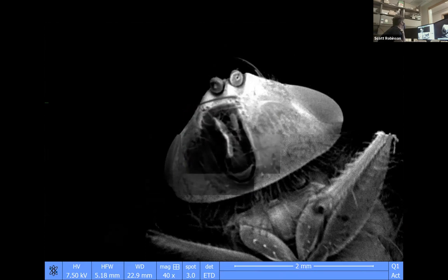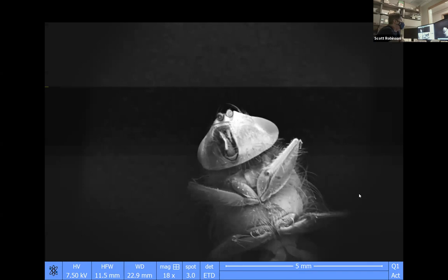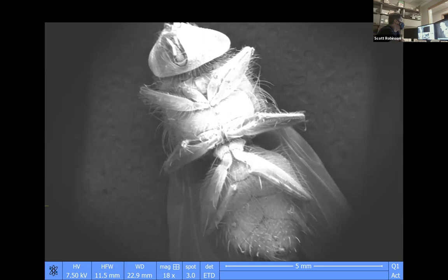I have a degree in English and biology, and it's helped me because for many years I used to rewrite publications and grant proposals for people, and then it just happened that I fell into doing electron microscopy. The kind of electron microscopy that I started out with is transmission electron microscopy, which is different from scanning electron microscopy. What we're doing right now is scanning electron microscopy, and we have an unhappy looking fly on here right now, and it's a little bit bright, so let's fix the contrast a little bit.